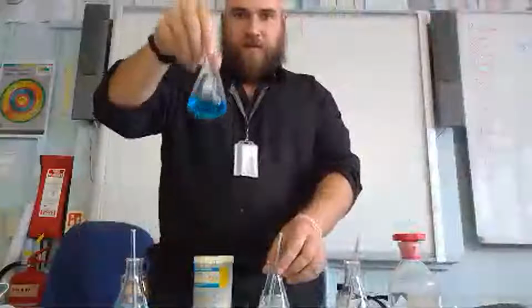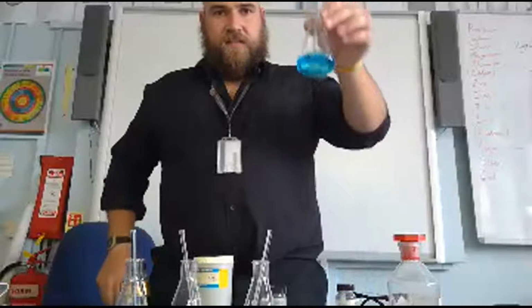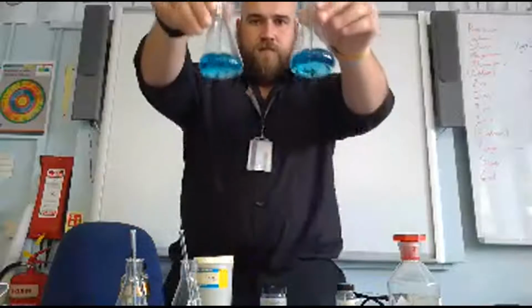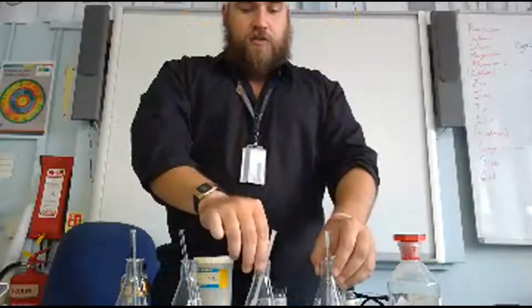Okay, so I've got my 4 solutions here of copper sulfate. And one thing you can hopefully notice about each one is the volume. So the volume of the solution stays the same.